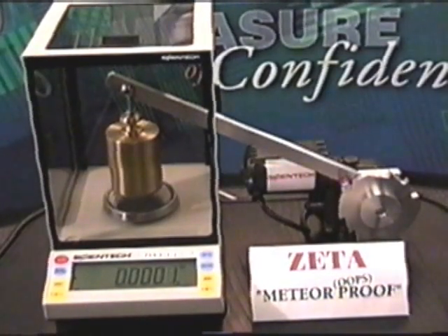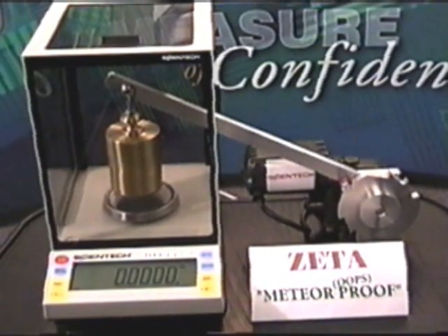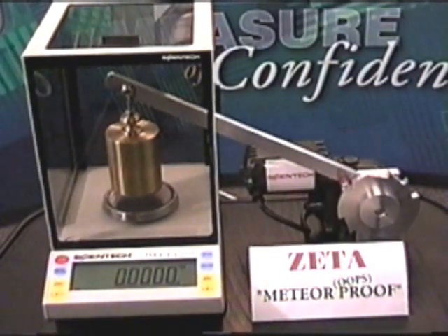Zeta models are value priced without sacrificing all the rich features you have come to expect from Scientec. With a 5-year North American warranty and our new proprietary technology, let the Zeta series from Scientec be your measure of confidence.